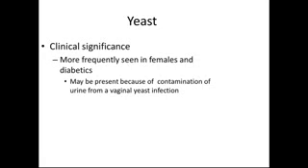Yeast, the clinical significance: more frequently seen in females due to the moisture in the genital area, and in diabetics due to the sugars present. The yeast feed off of that.